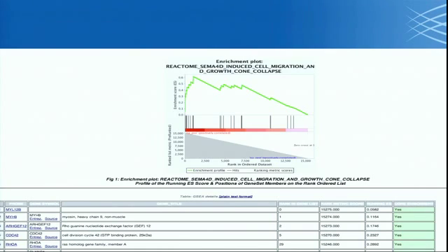More often it's used to validate the list itself, where you sort of know what the biology is that you're studying, and seeing genes related to that biology score is very encouraging. It's an unbiased way of saying, okay, you thought you were doing a screen related to glycolysis. Well, do you see glycolysis genes score? So that's what you do with it.